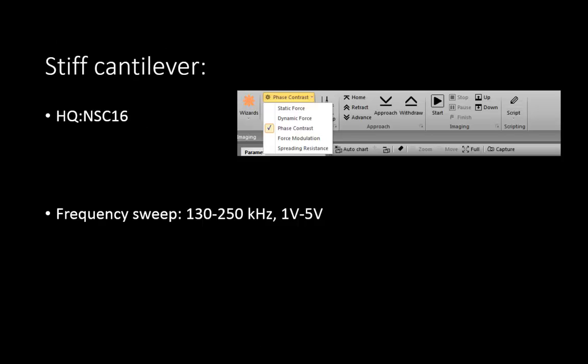After you are done with obtaining the force curve with the weak cantilever, use the stiff one. Switch to the HQNSC16. Set the imaging mode to phase contrast and obtain a frequency. You should already know how to do this based on the previous lab.